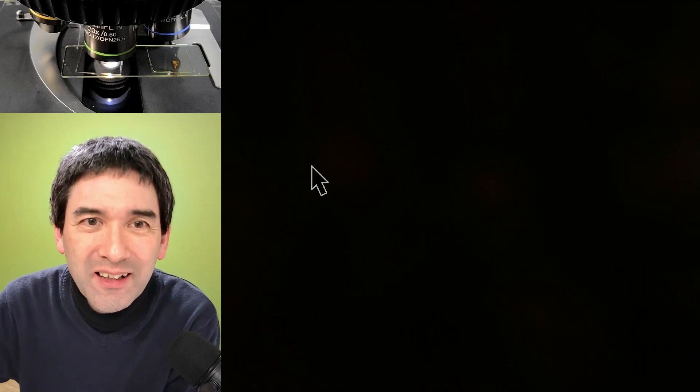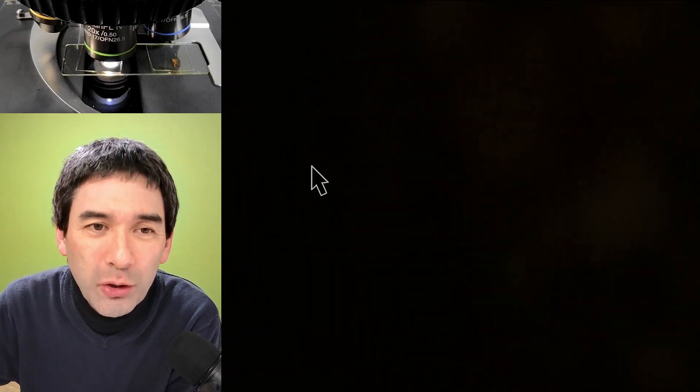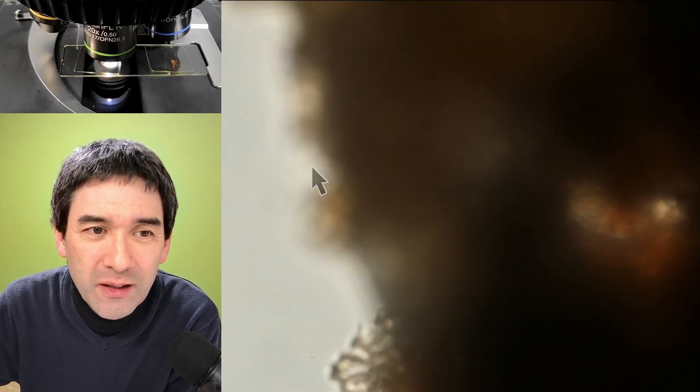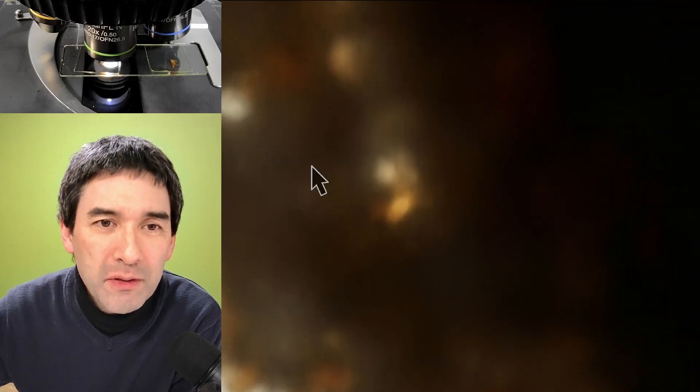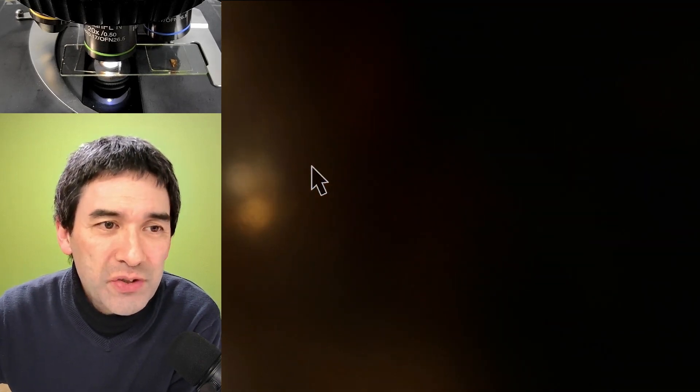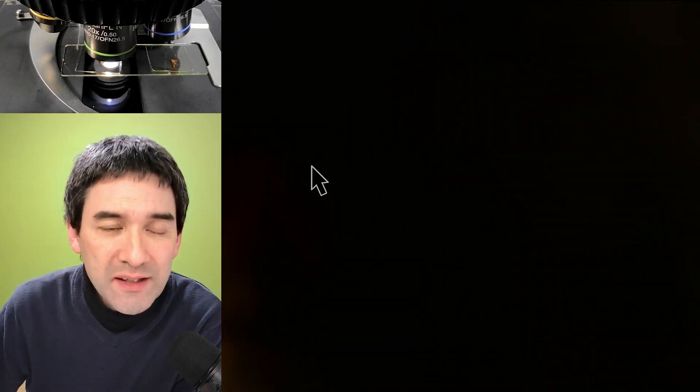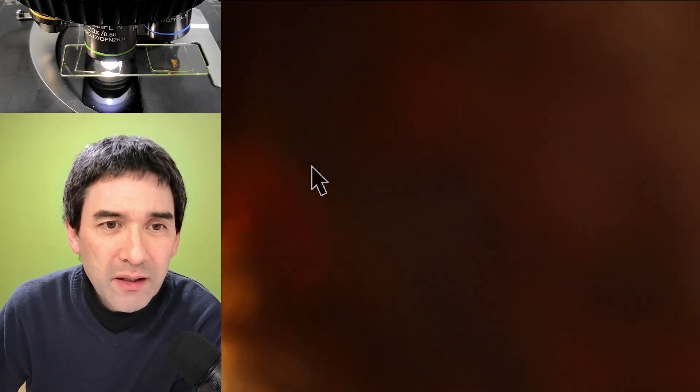Totally way too dark. I did not change the lamp. I can try to focus a little bit. But you see, it's basically almost nothing. You can see almost nothing here. I'm going to go up with the brightness now. And you see, that's how it looks like. I turn off the arrow again. We don't see any details because it's so dark.